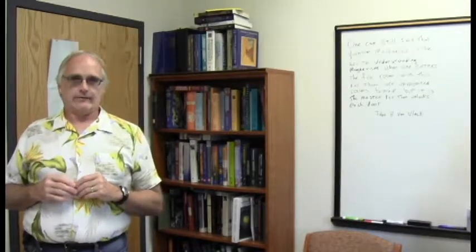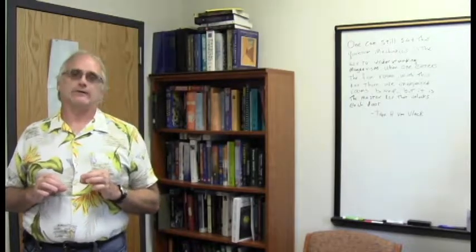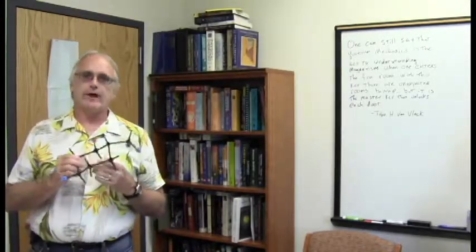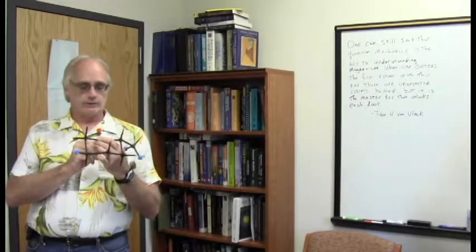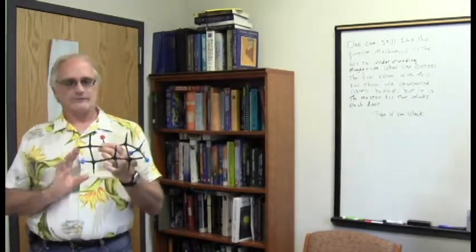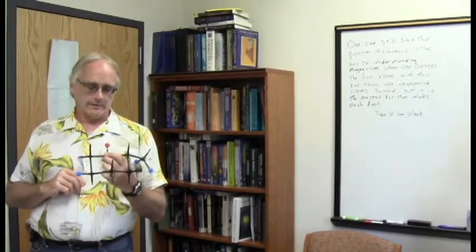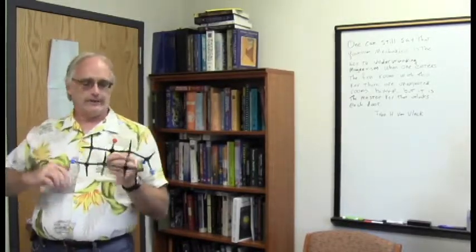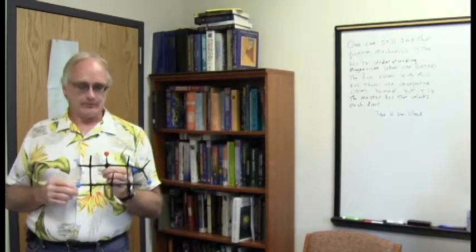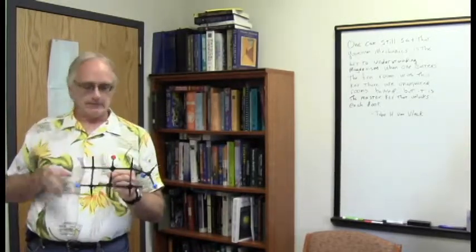Now that we've gotten the easy ones out of the way, the fairly obvious ones, it's time to move on from there, and this is where the COSY is going to start strutting its stuff in this game. And so the strategy is going to be to go from one of the positions I know, and position F is a really good one here, since it is the most downfield, farthest away from anything, so it suffers least from any overlap and interference and second order effects and all that stuff that can affect the appearance of our spectra. And so position F is going to be the one that I'm going to start on, and I'm going to go to the COSY spectrum and see what position F is coupled to. And what I'm looking for is, can I use it to find position D and position G in this molecule?